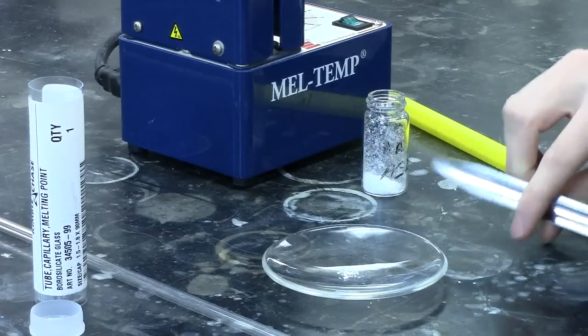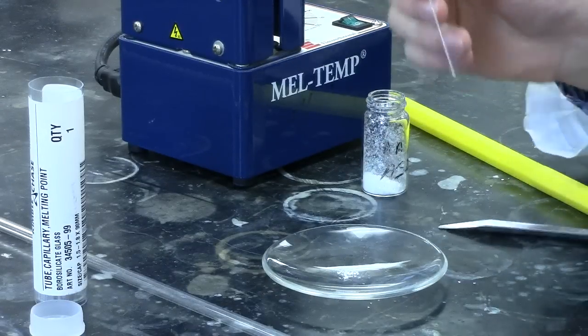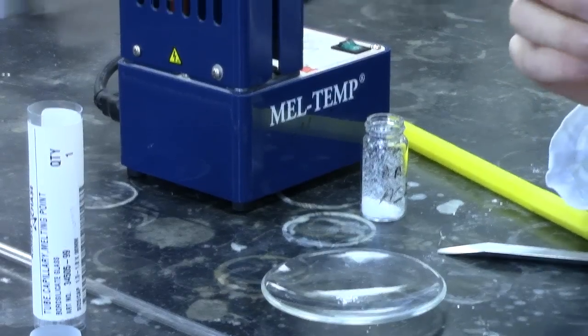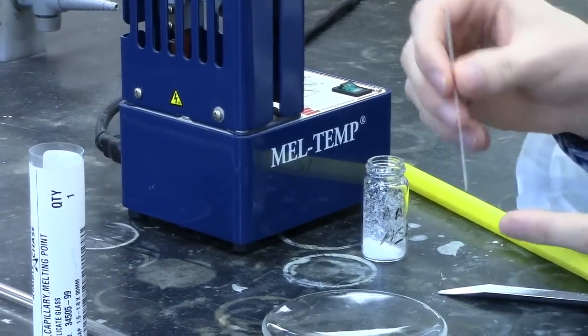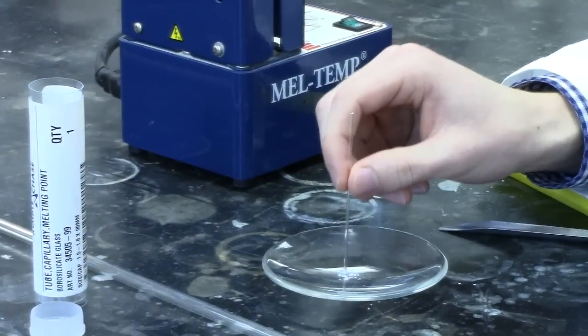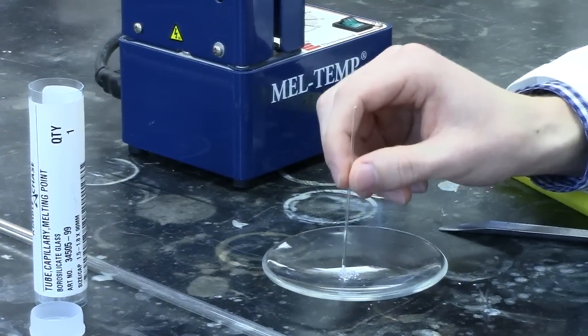The reason you want your sample in a fine powder is because you'll be dabbing the open end of this capillary tube into the sample in order to bring the sample up into the tube itself. You'll be looking to put at least one to two millimeters of sample into the tube.